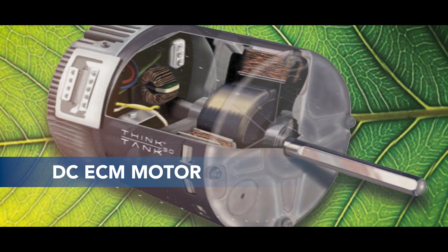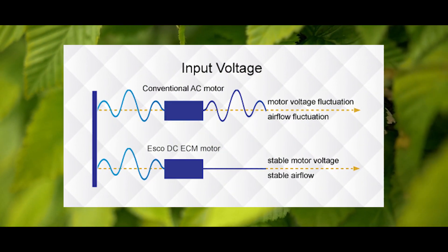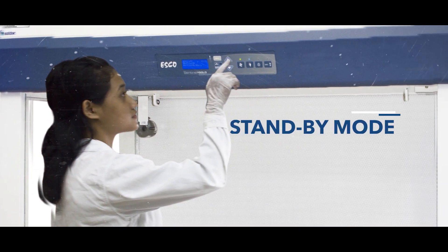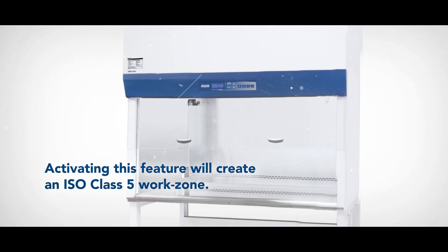It is powered by the latest generation DC ECM motor, which saves up to 70% energy consumption compared to an AC motor. You can also operate the vertical cabinet in a standby mode to further reduce power consumption by up to 60%. Activating this feature will create an ISO class 5 work zone.